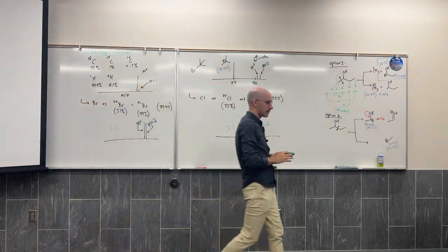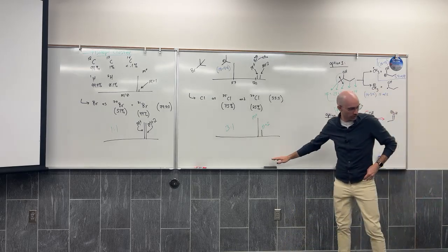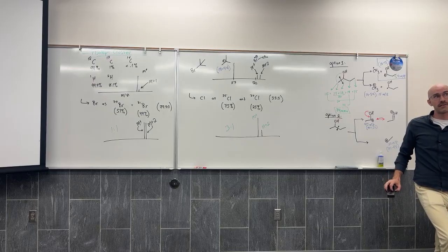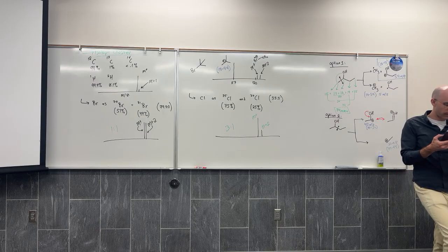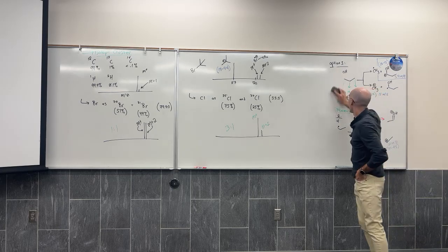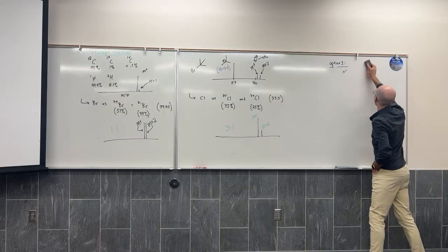So let's look at the spectrum for 1,2-dichlorobenzene. The molecular mass for this is 75 plus 70, so 145. Do we see a signal at 145? No, I'm sorry, it's 76 plus 70. So do we see a signal at 146? Yes. What is it? Our base peak. Our base peak shows up at the molecular ion.